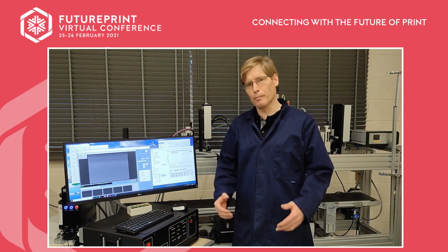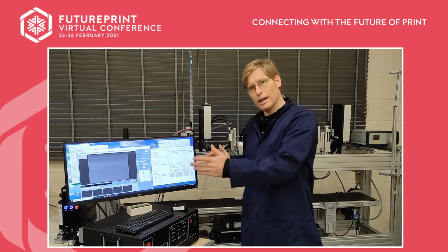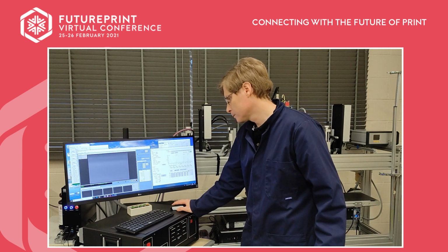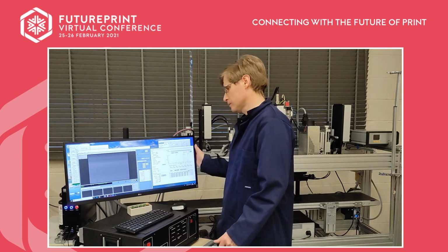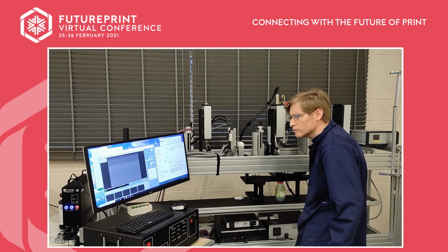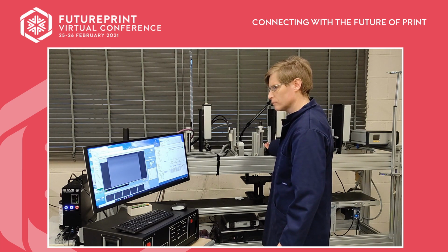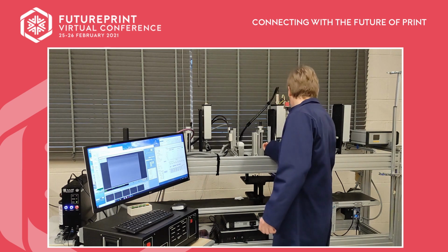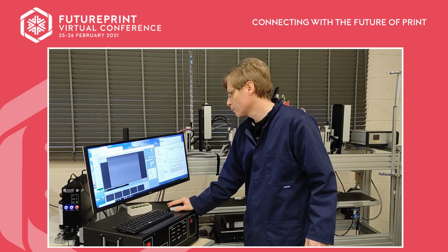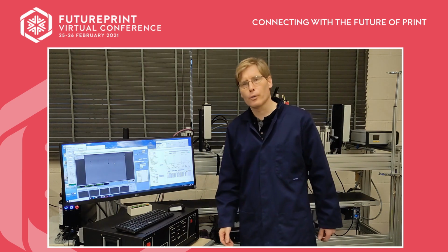Now the hardest thing always with moving from one head to another is finding those drops again in focus. So actually, I'm going to tilt the screen slightly to me whilst I change the focus, so it may not be so easy for you to see on the camera. So now we see some drops.